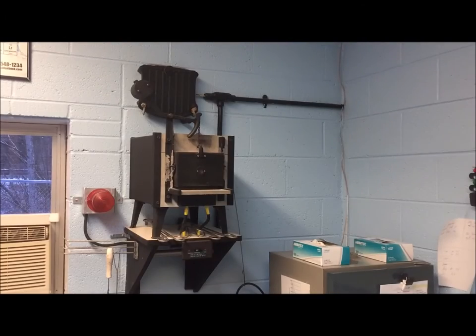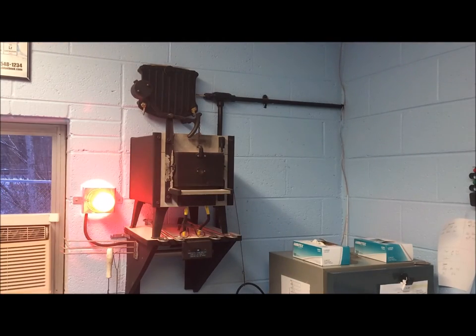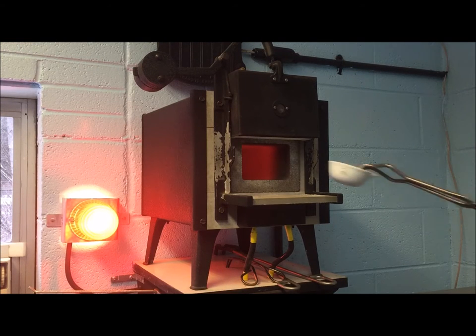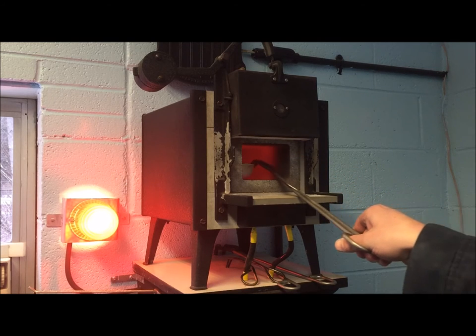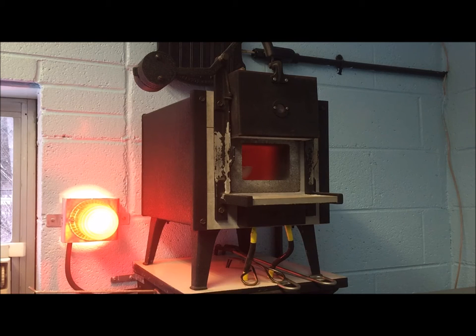To test the volatile portion of our samples, we must place the samples in a muffle furnace. The furnace is set at a temperature of 500 degrees Celsius or 932 degrees Fahrenheit. The high heat is used to burn off all the volatile solids so we can weigh the remaining non-volatile solids.